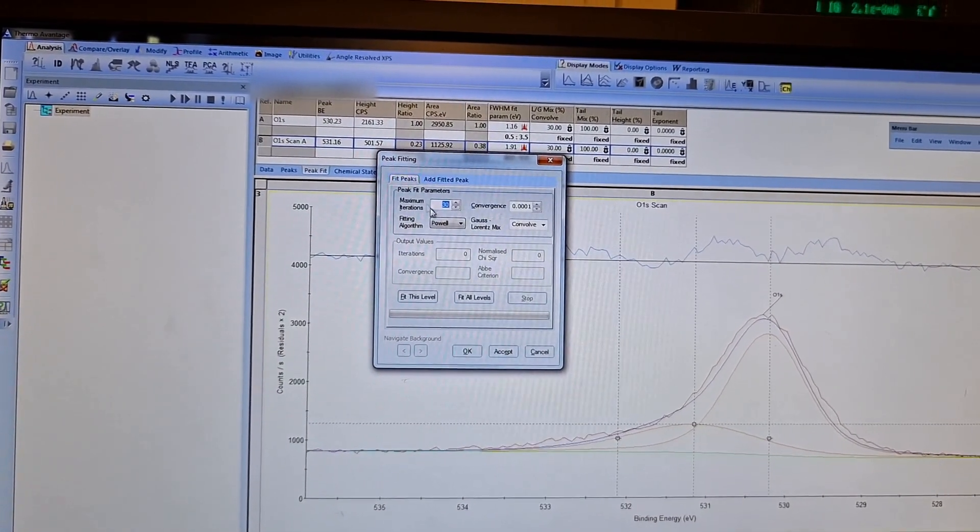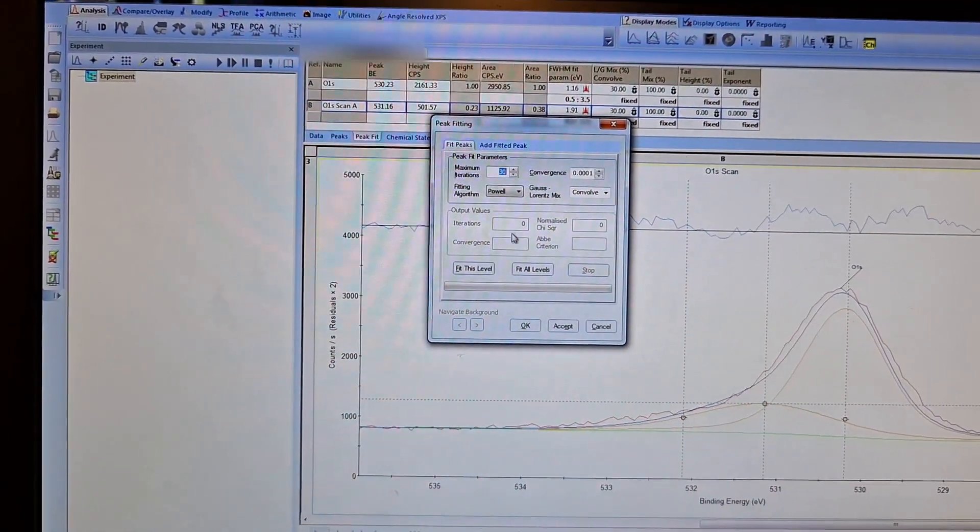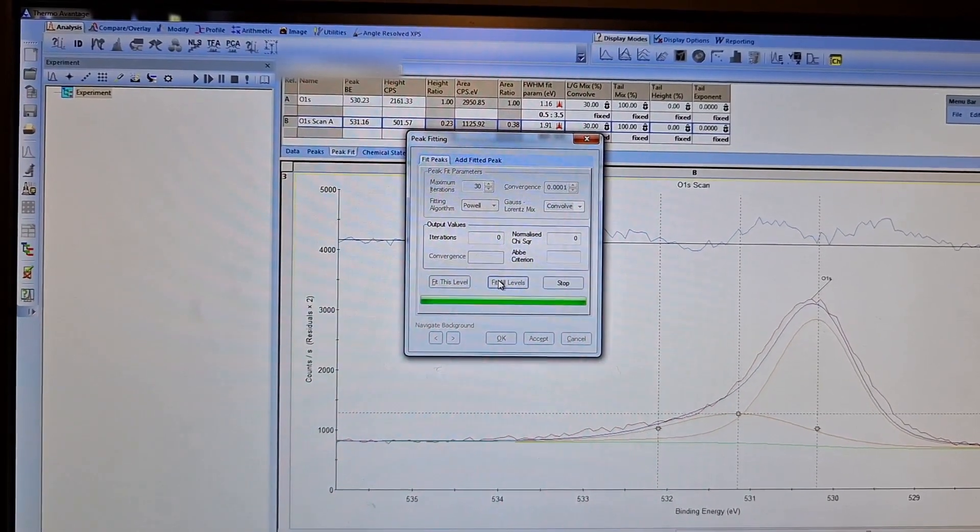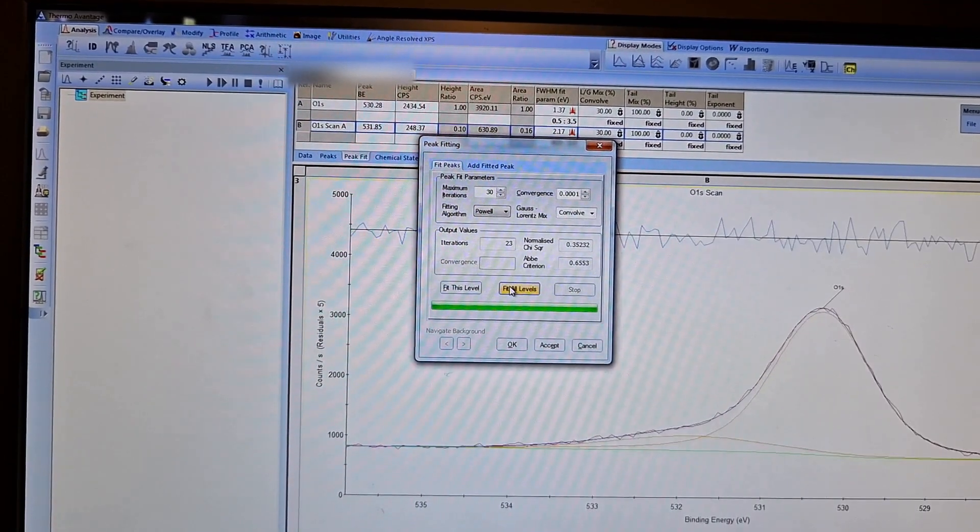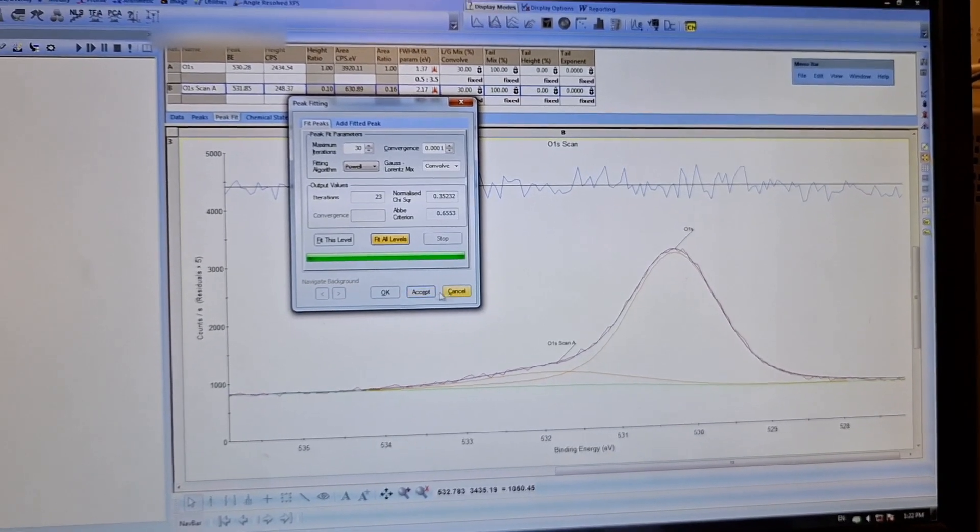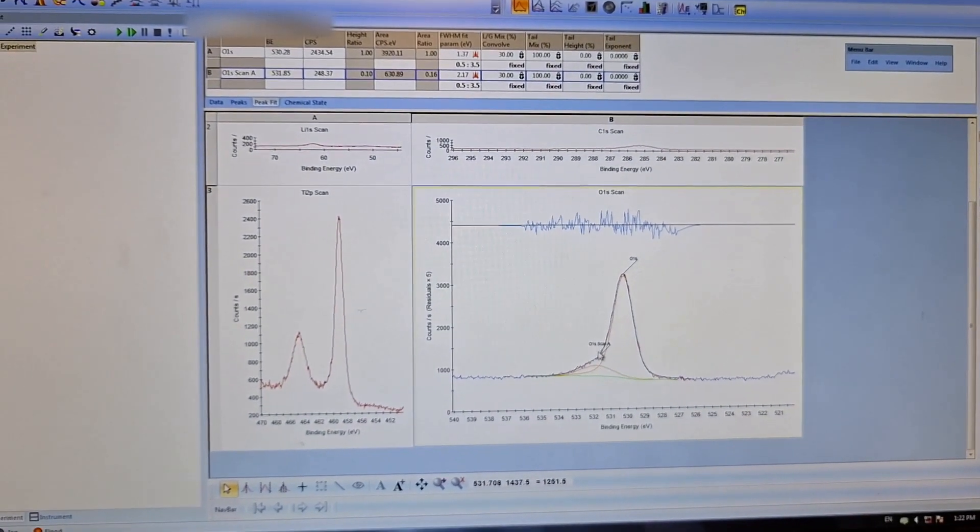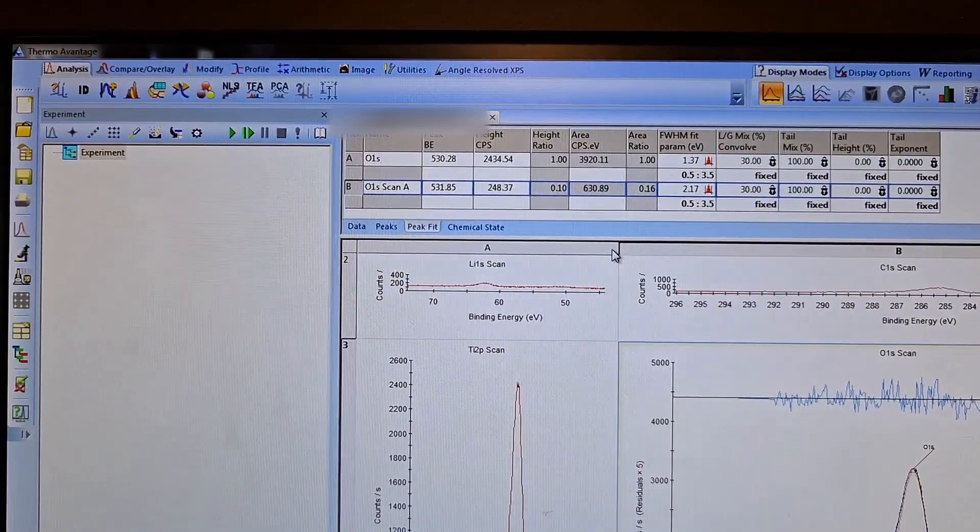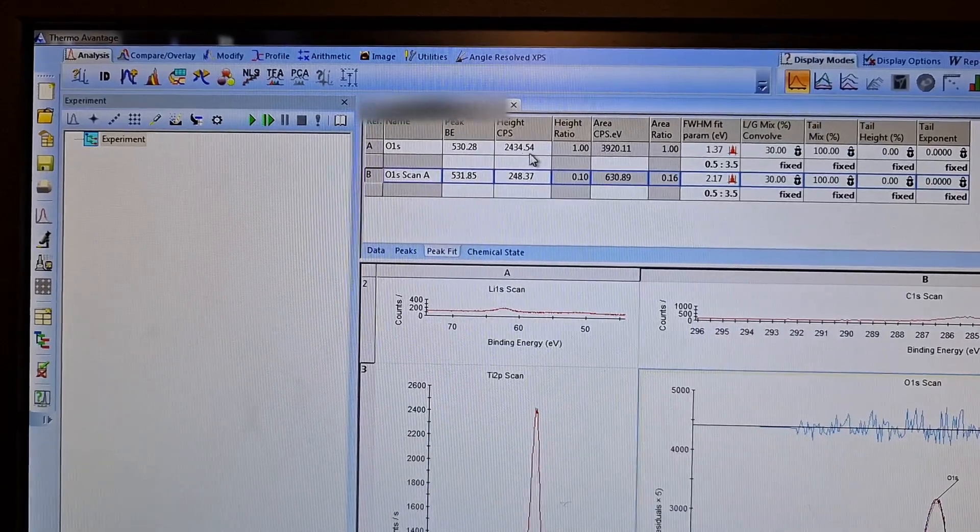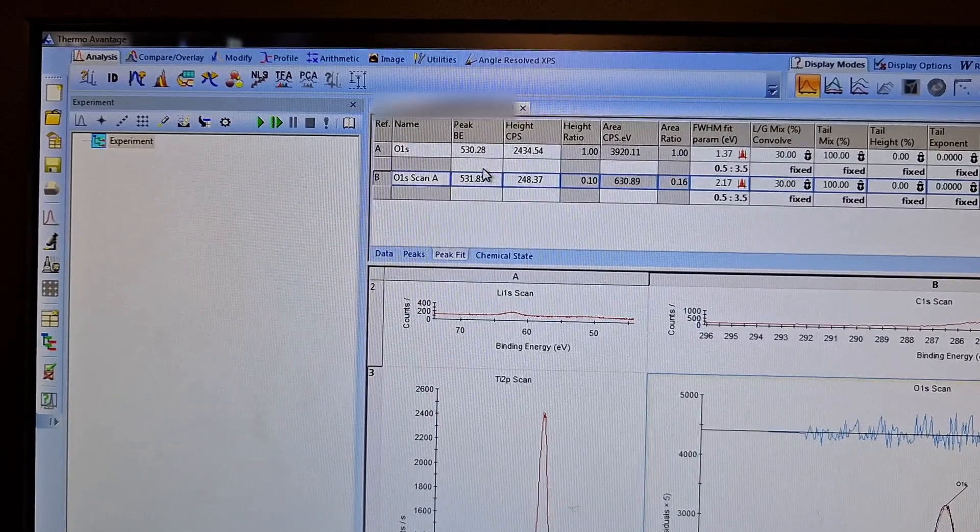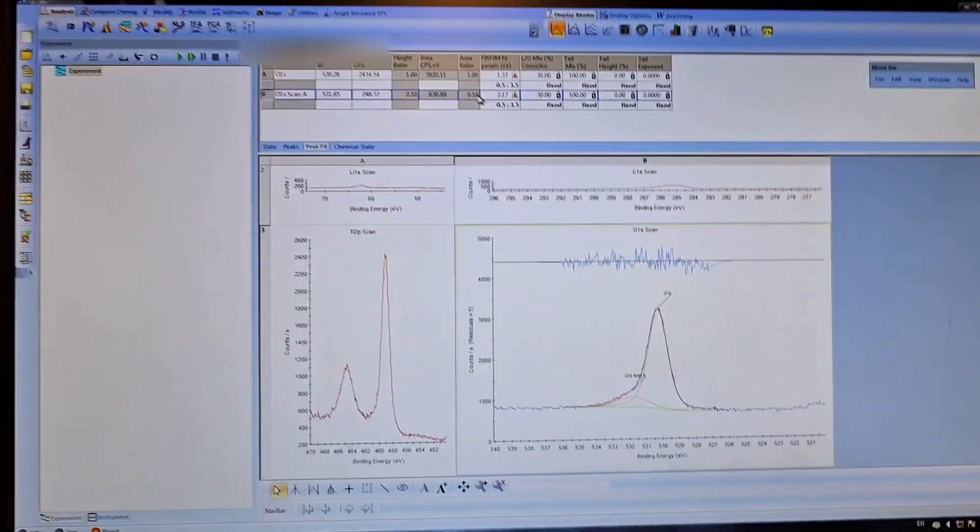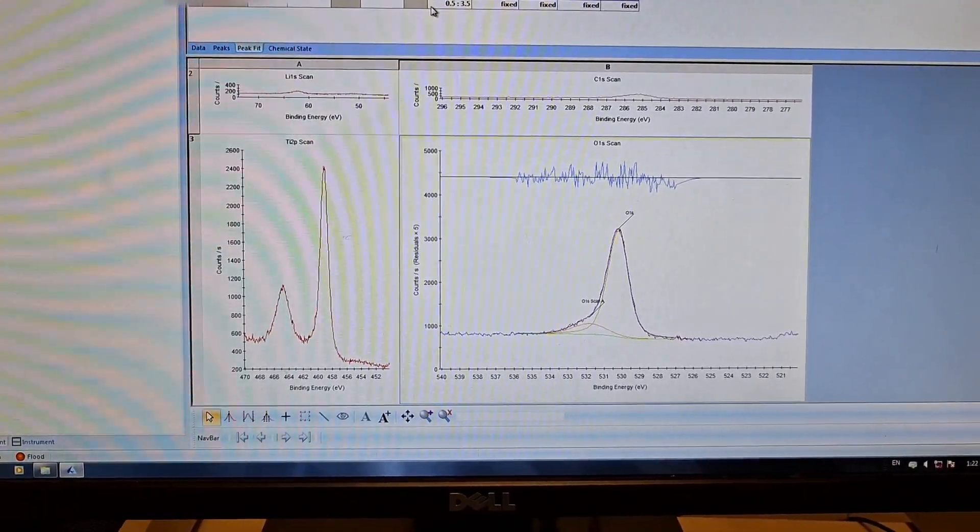In the fit peaks part, in the peak fitting, I can fit all levels. If I click it, it will fit. I am still waiting. Okay, it finished. Accept. This is one of the oxygen peaks and this is the other oxygen peak. At the top I can see the peak area, peak height, CPS for the peaks, binding energy of the peaks, and other stuff. That's all for the peak fitting of oxygen.